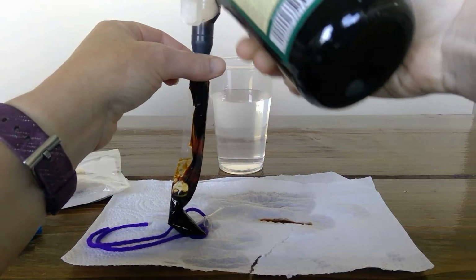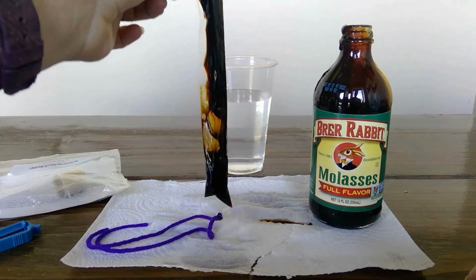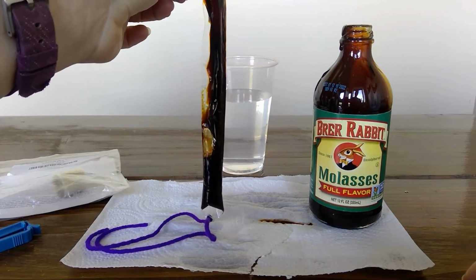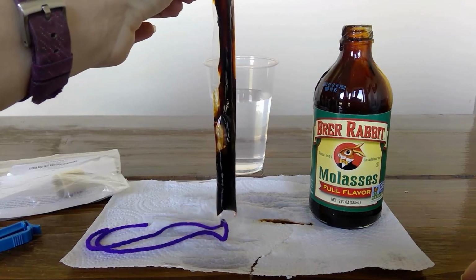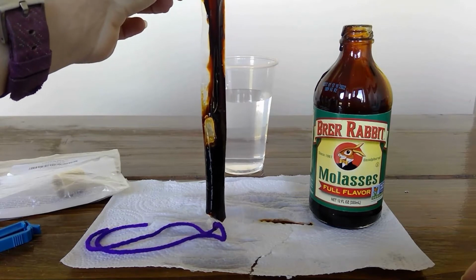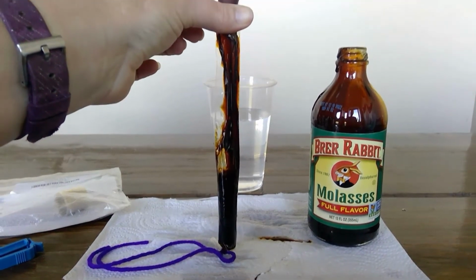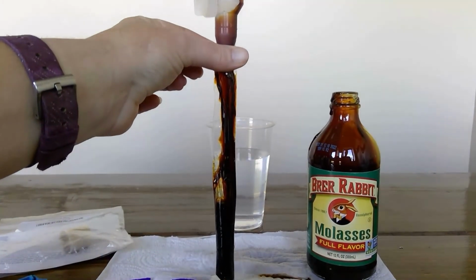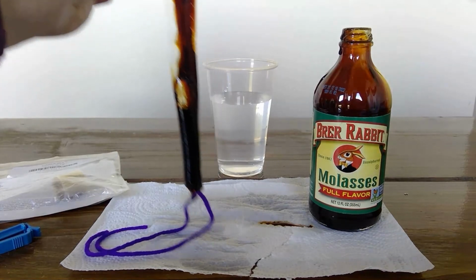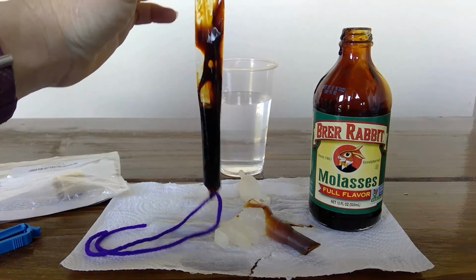Molasses is very thick and sticky. Think of maple syrup, but even thicker. You can see it's kind of slowly draining down into the tube there. It's very thick, very sticky, kind of the consistency of honey, even a little thicker, like thick honey. All right, so we're going to push the rest of this molasses down.